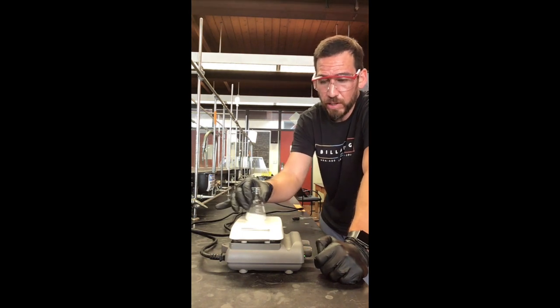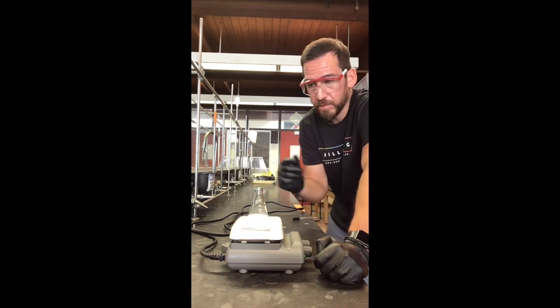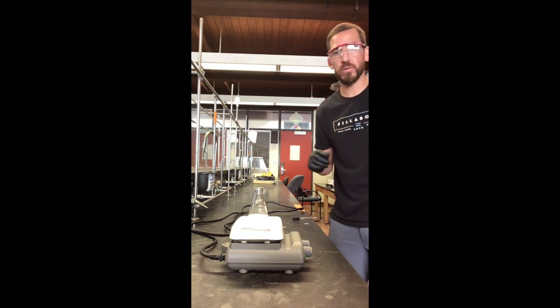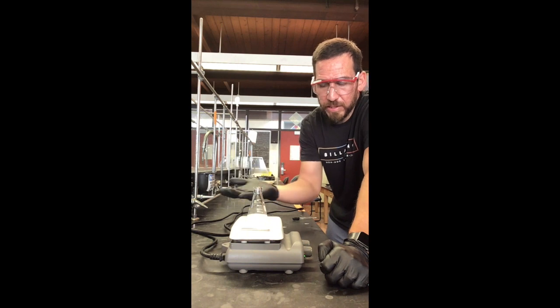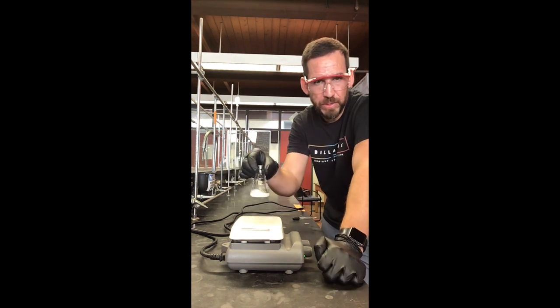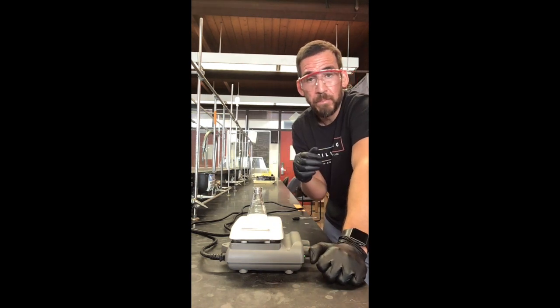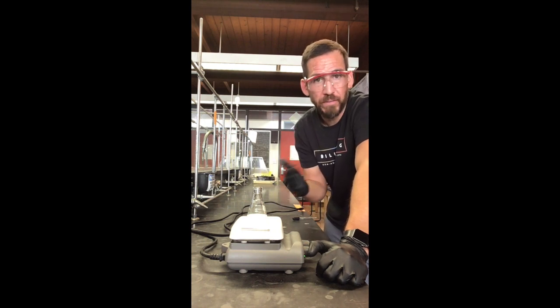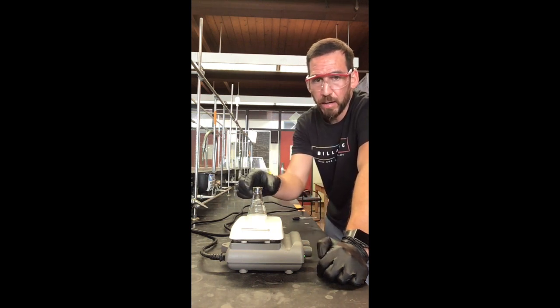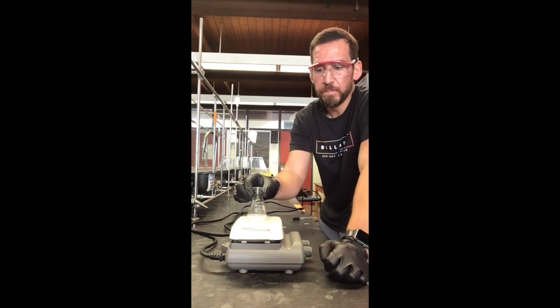Now, what I've done here is I have it in a flask, so that way if it gets hot, I can use a nice test tube clamp to go ahead and lift that off. But this isn't going to get so hot that I won't actually be able to grab it with my hand. But that's something you need to be aware of. Know what you're working with, how hot this is going to get, and then make sure you have the proper safety precautions to make sure that you can take care of it safely, right?